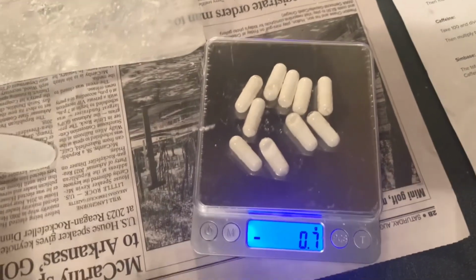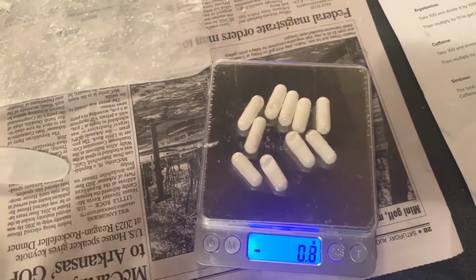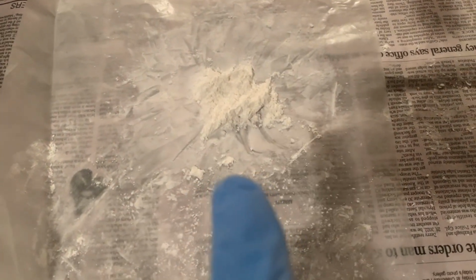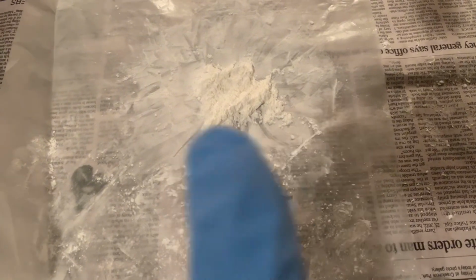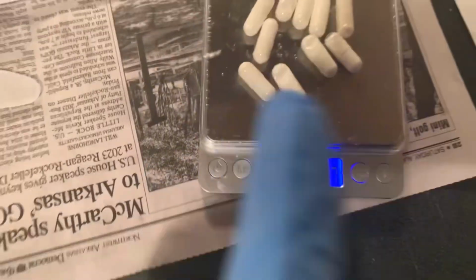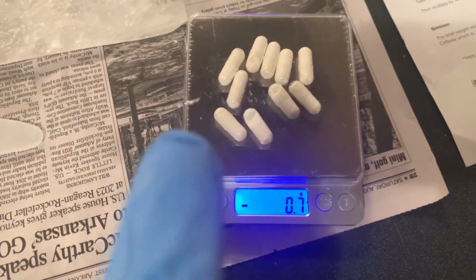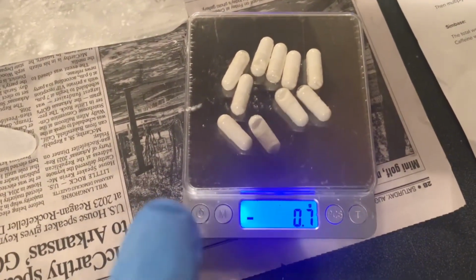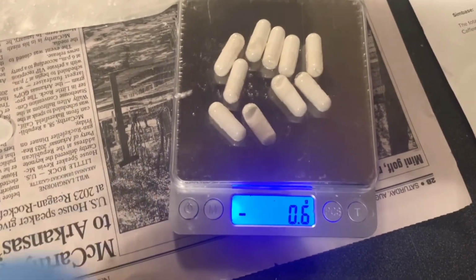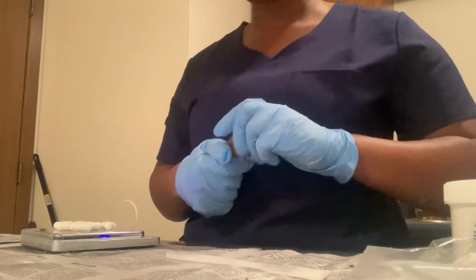So that you won't make that mistake, I'm showing you that every single bit of what we have mixed together from the powders, caffeine, ergotamine, and the Symbase, all of that needs to go in here so that your weight can come out 6.7 grams or 7.35 grams, which is what the total weight for the 10 capsules needs to be.